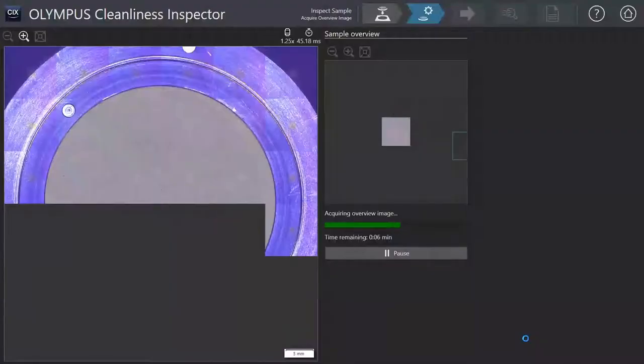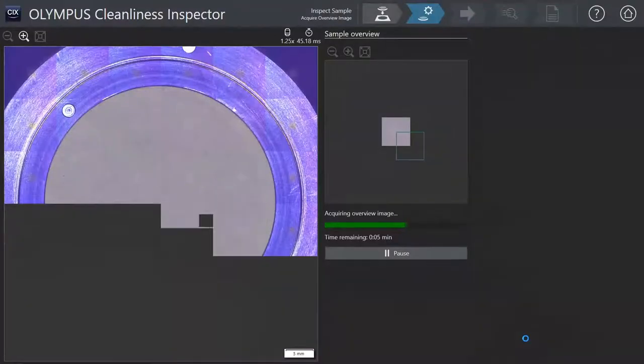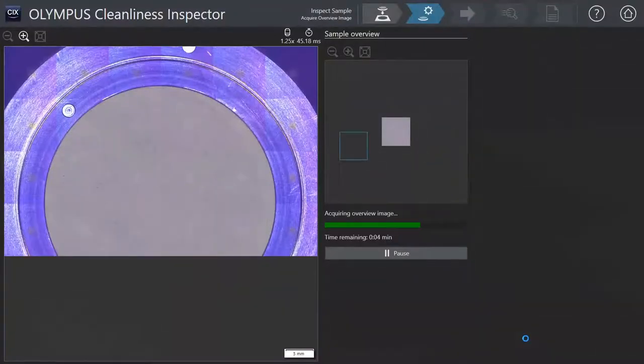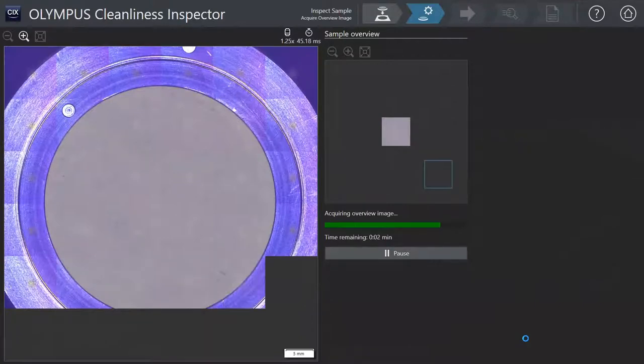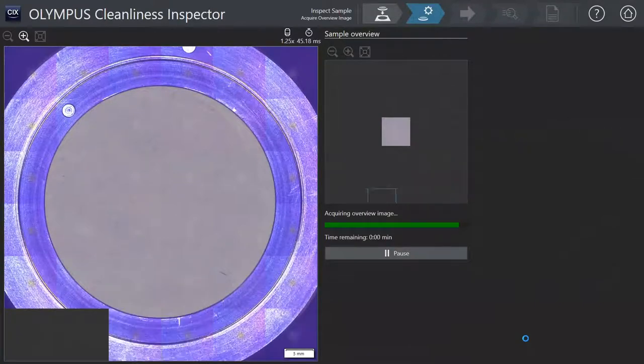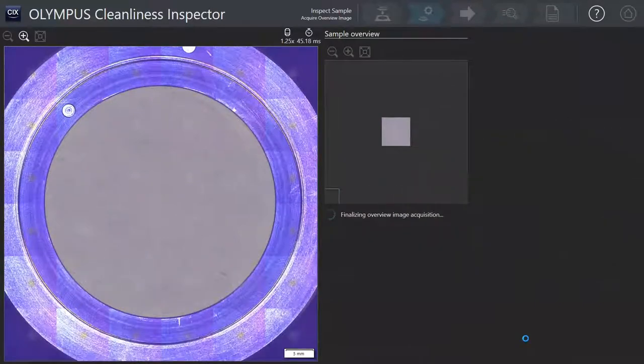Before inspection even starts, the system presents an overview image to assist you in identifying filter coverage and particle clusters.